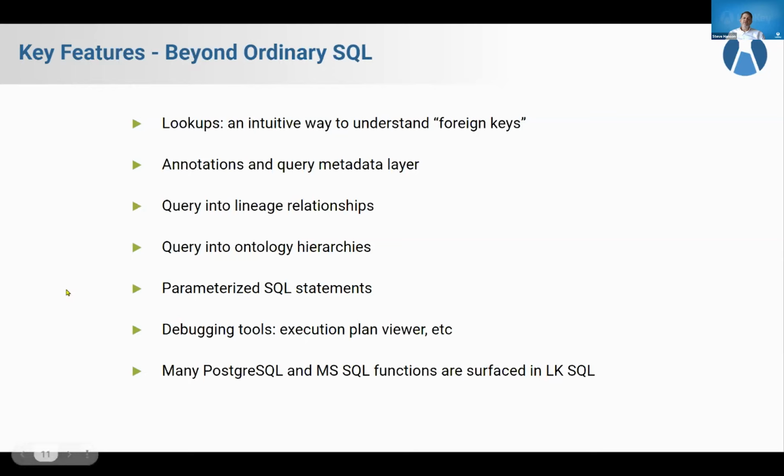We also give you the ability to write parameterized SQL statements. This is a really powerful way to make your SQL more versatile. And we actually have an example of that if we have time.